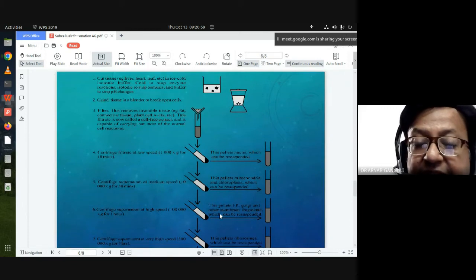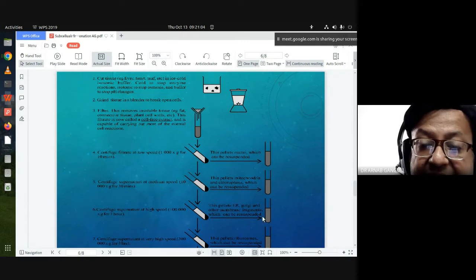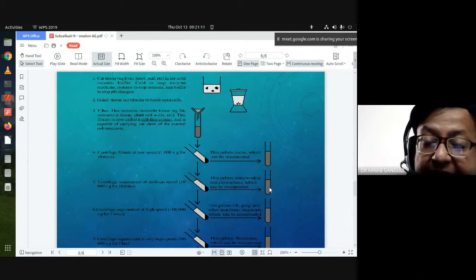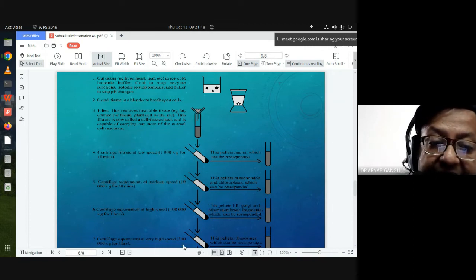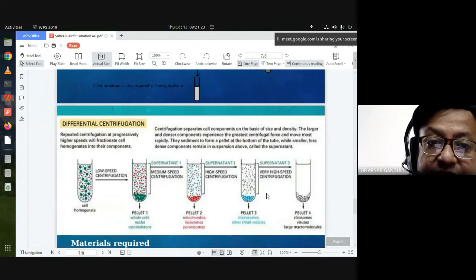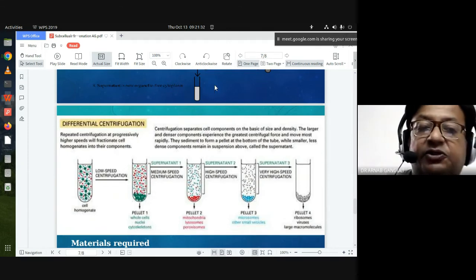In the pellet you'll have endoplasmic reticulum, Golgi, and other membrane fragments. So in the first pellet you have nuclei. Then you have separated mitochondria, chloroplast. Then you have separated Golgi and other membranes. And then at 300,000 G for 3 hours, you will pellet the ribosomes. Okay? And then the supernatant is now organelle free cytoplasm. You'll have some tRNA, some soluble and cytosolic components.